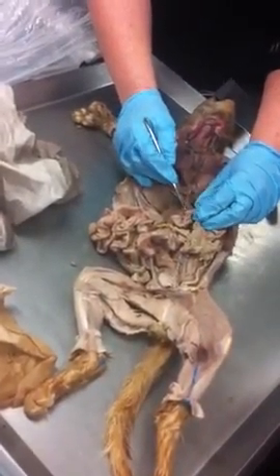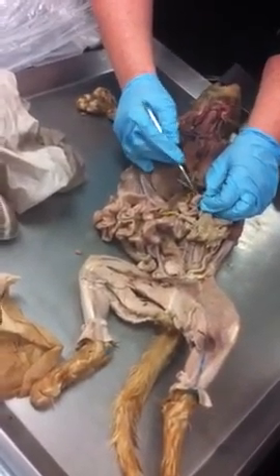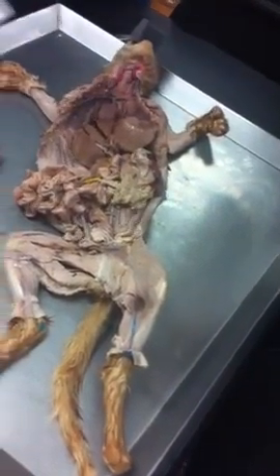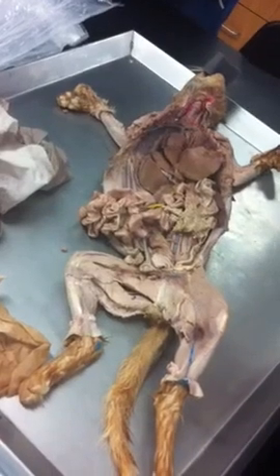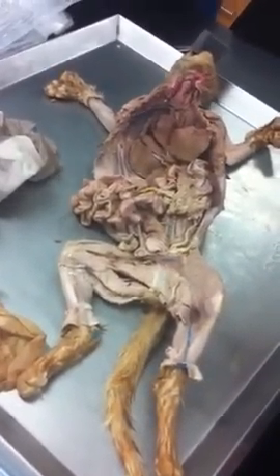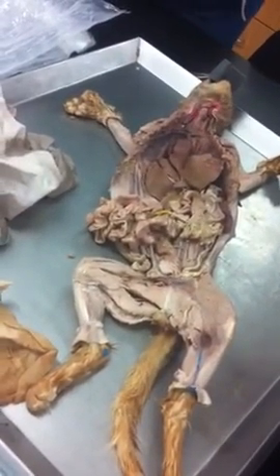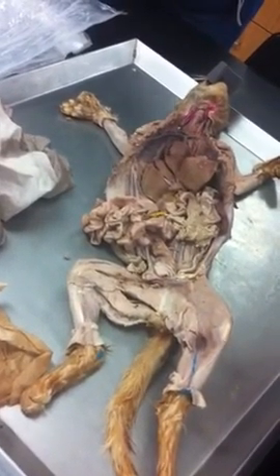I wanted to get the pancreatic duct out. Didn't work. Didn't get it. So that'll be a model question. So the hepatopancreatic duct, ampulla, and sphincter will all be on the model. But you can kind of get part of those. So you could be asked about the hepatic ducts or the cystic duct, and how we got there.